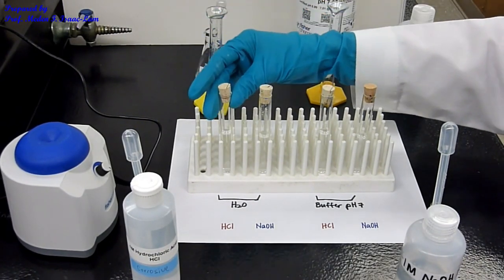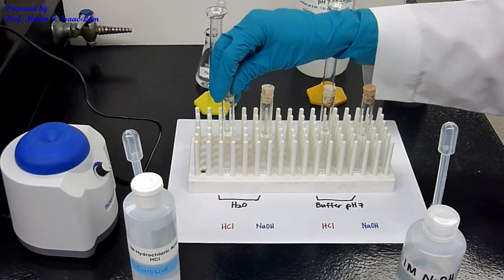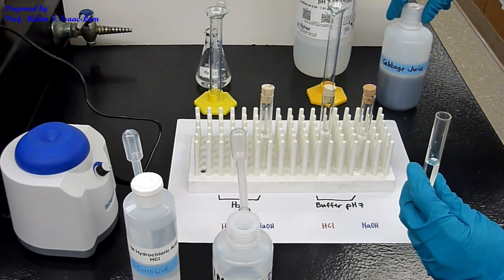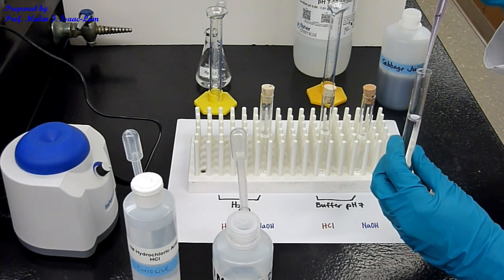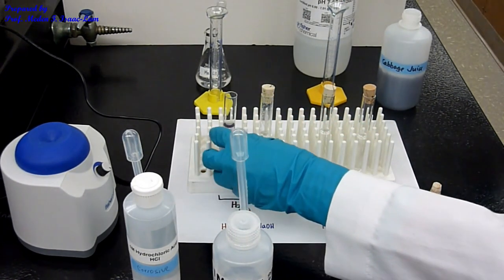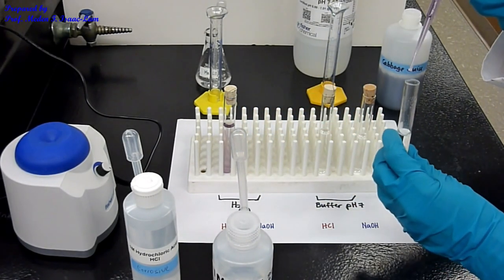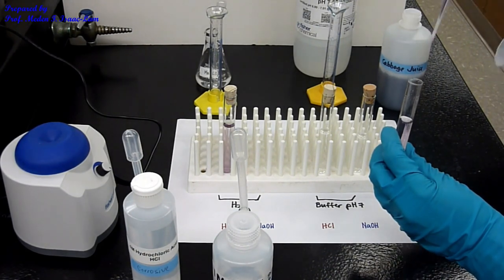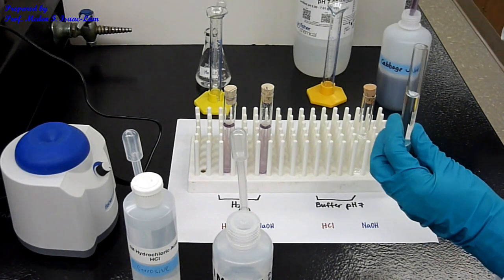tube. So I now added 5 ml of the RO water, 5 ml RO water, 5 ml buffer, 5 ml buffer. So I'm now going to add 20 drops of the cabbage juice in here. So 20 drops. Okay, so note the color. Again, 20 drops, initial color. And then the buffer. So, initial color.